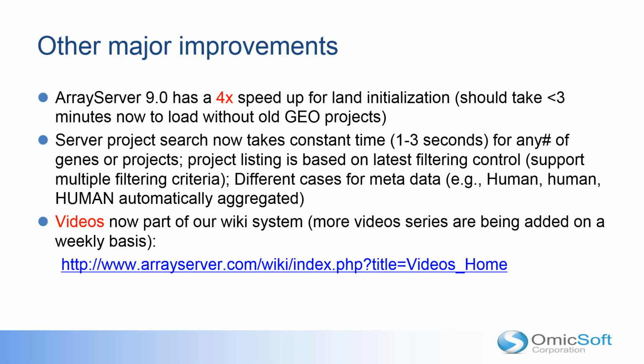We also tried to clean up the data, especially historic data, from our side. So if you have different cases like capitalized Human, lowercase human, or all-uppercase human, they will automatically be aggregated when you see the results of this project list.